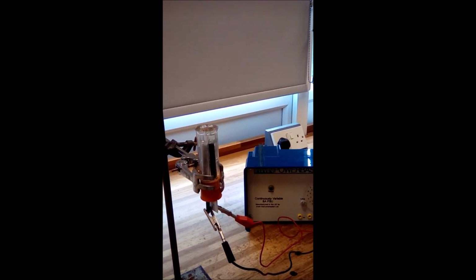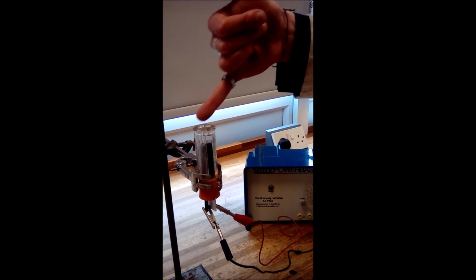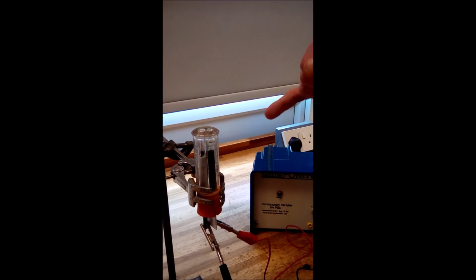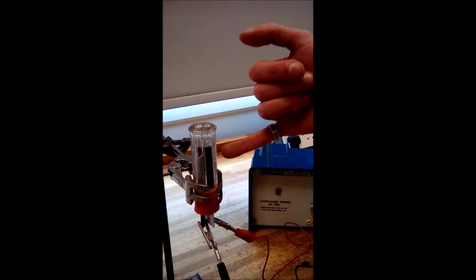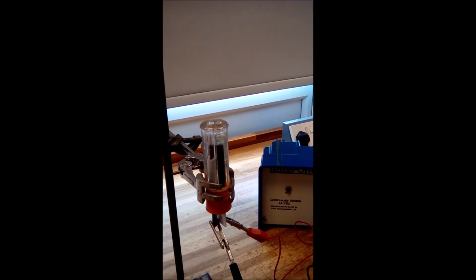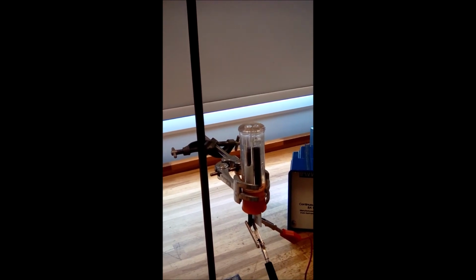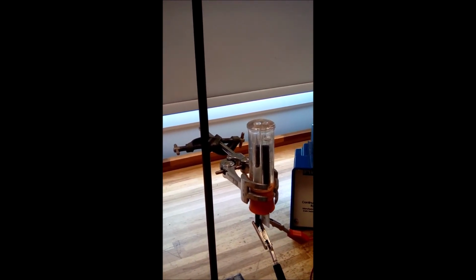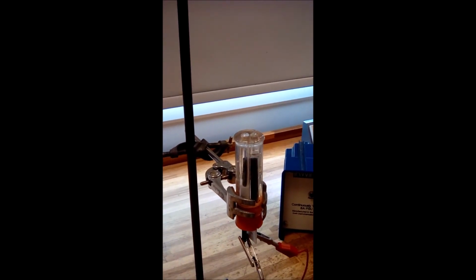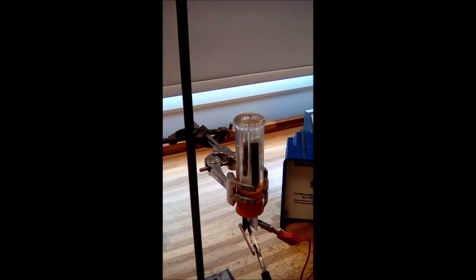So our check for chlorine at the end of this reaction, once we've caught all the gas, we've got little test tubes on each of the anode and cathode in order to catch the gases. So once we've caught all the gas, we're going to test it with some damp litmus paper. This litmus paper should, if we do it correctly, change color in the presence of chlorine. So we've got our damp litmus paper, just waiting till I've got enough chlorine.